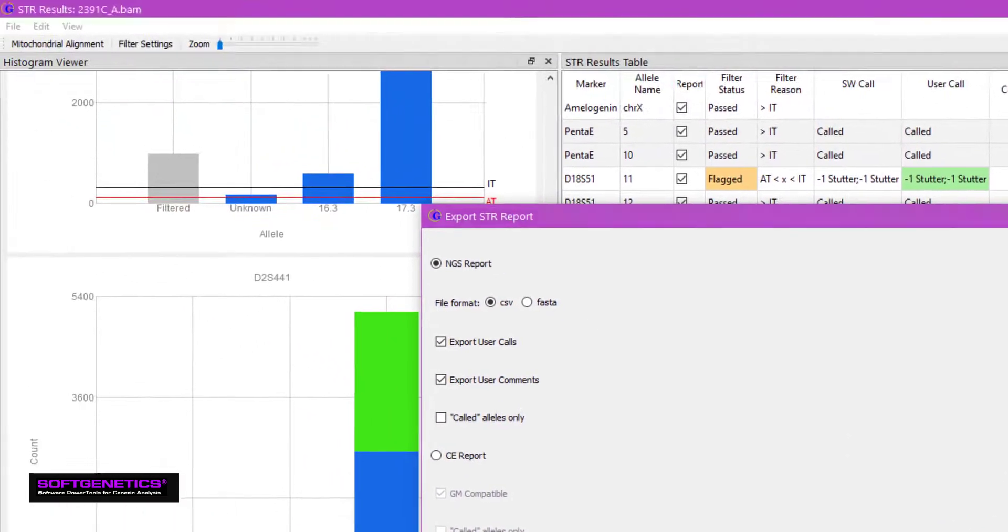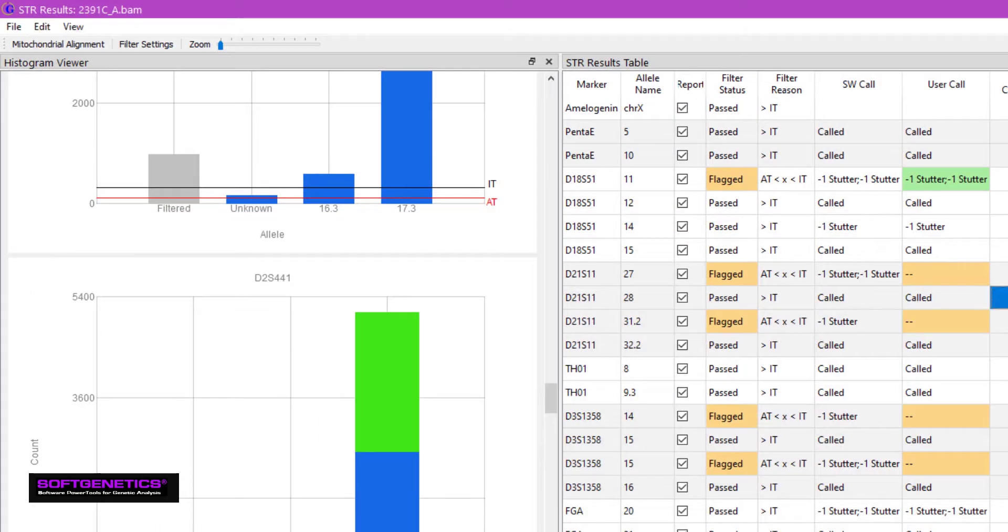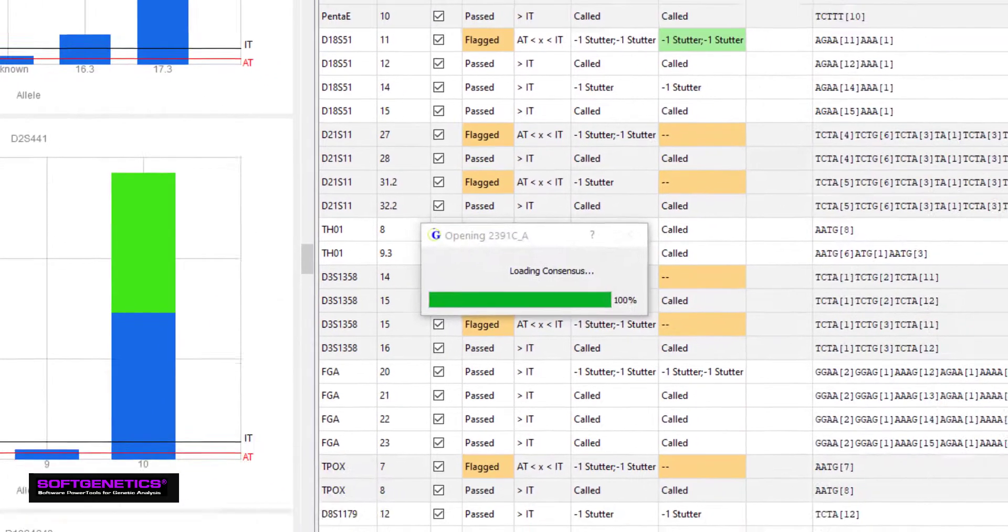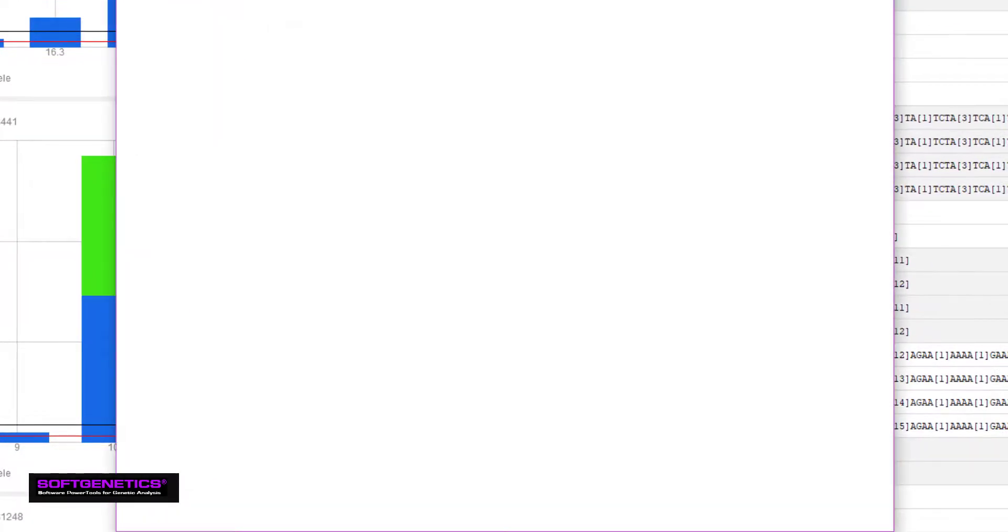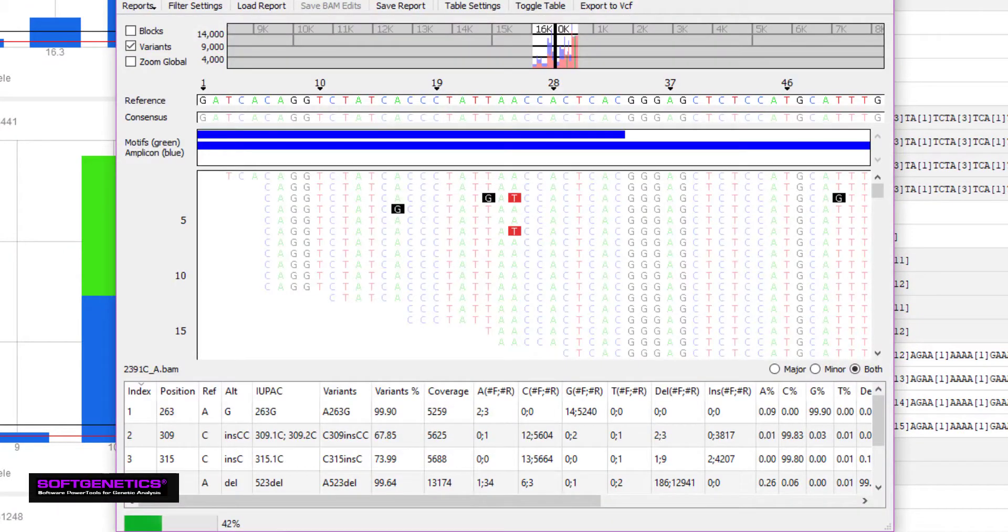Mitochondrial DNA results are available by clicking on the Mitochondrial Alignment tab. For an explanation of the mitochondrial alignment viewer, please see our GeneMarkerHTS introductory webinar.